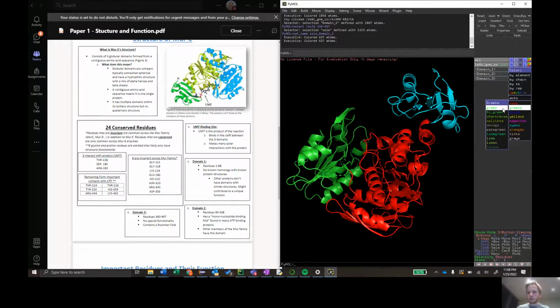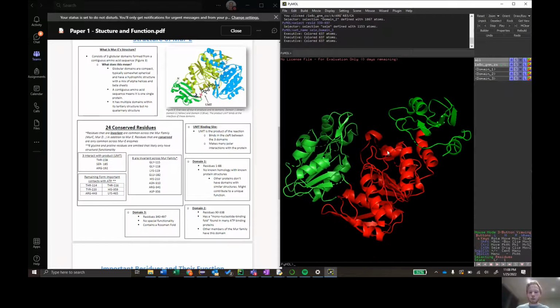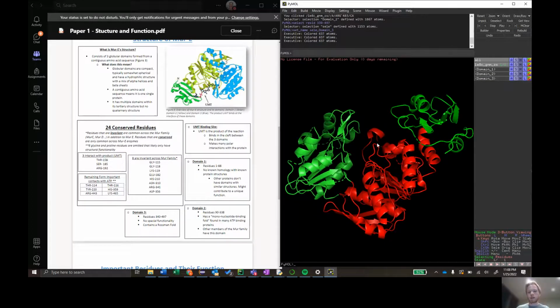Because the purpose of the reference model is to basically serve as a basis for which you'll analyze your drugs or your ligands that are binding to the protein. Because you want to be able to look back and see, well, where are the structures of binding, what's a good way to represent that, and is it therapeutically relevant?